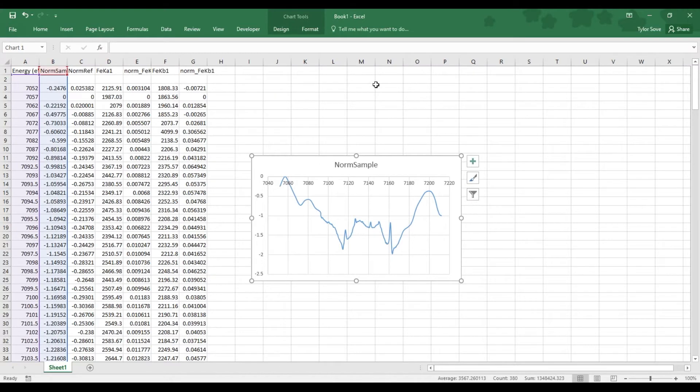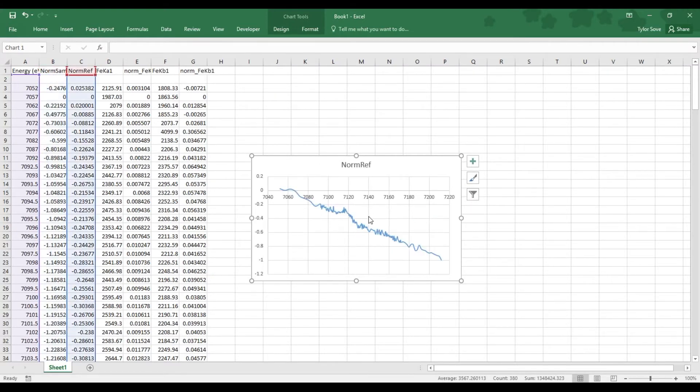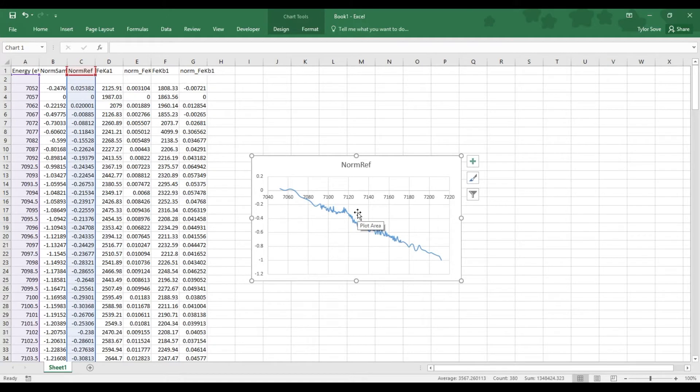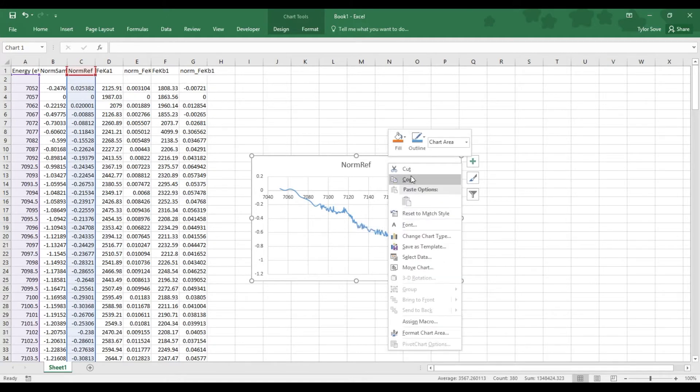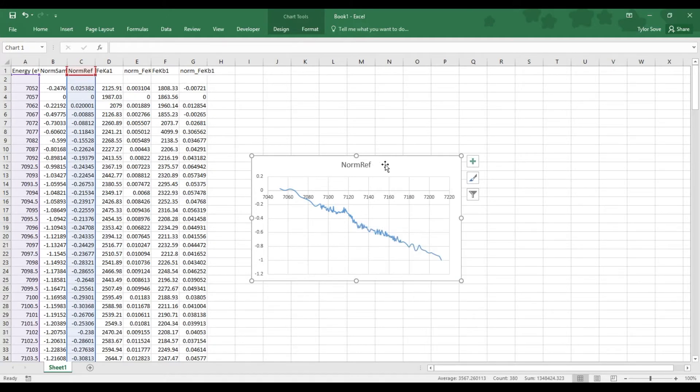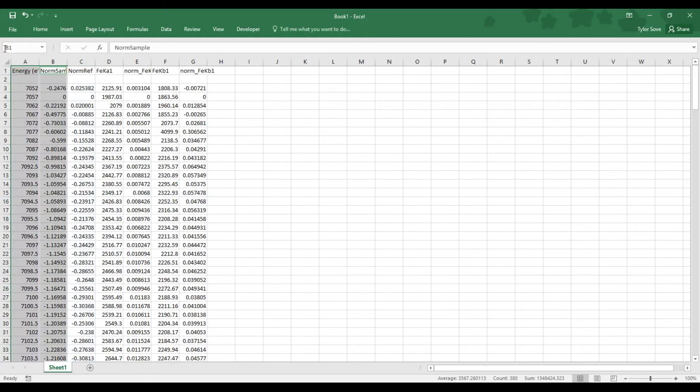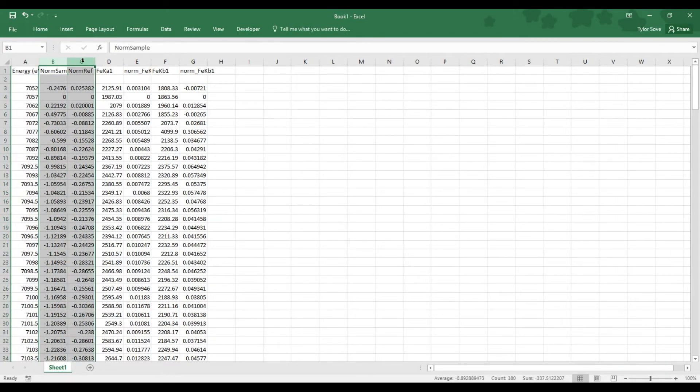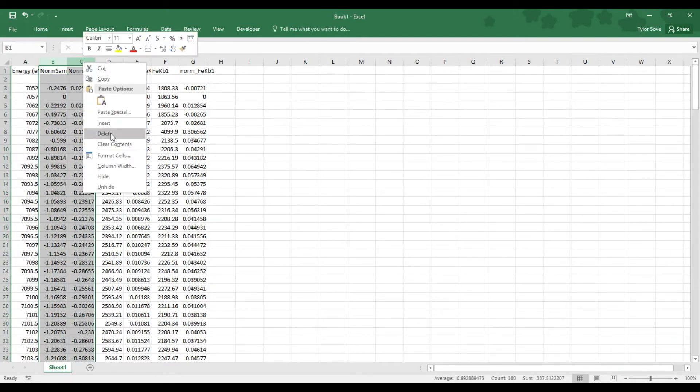Now if Norm Sample looks like this or something similar, and Norm Ref looks like this or something similar, your sample was insufficient to do absorption-based XANES. And so in which case we'll delete this graph, and we'll delete Columns B and C as we had done before.